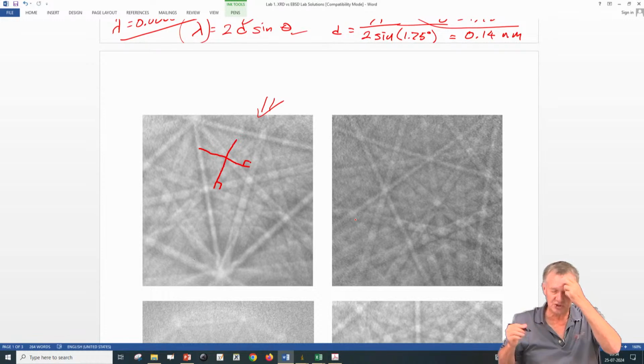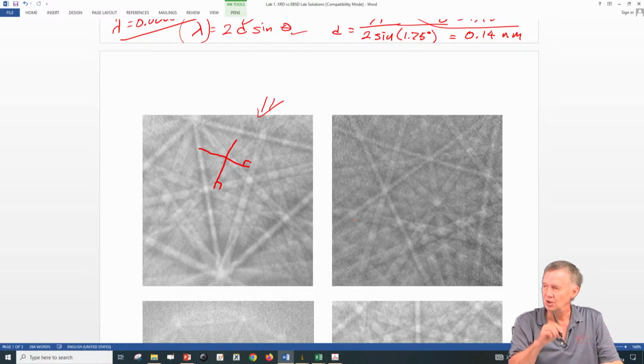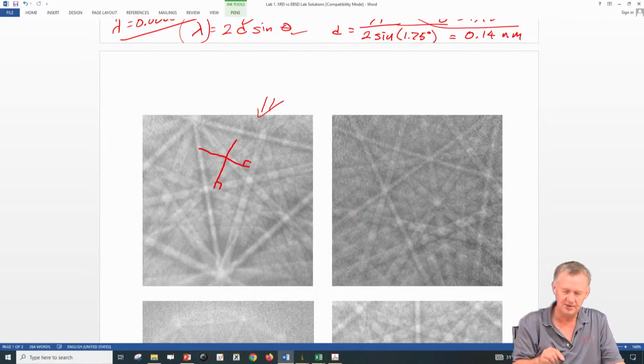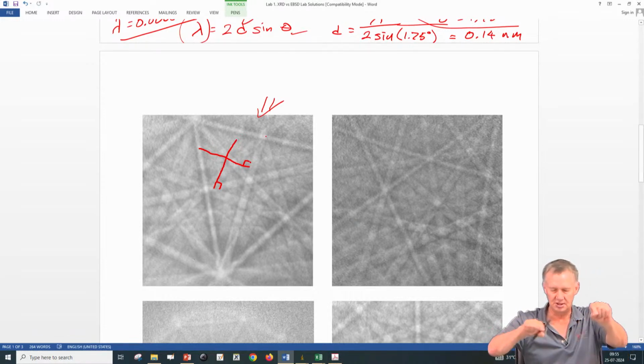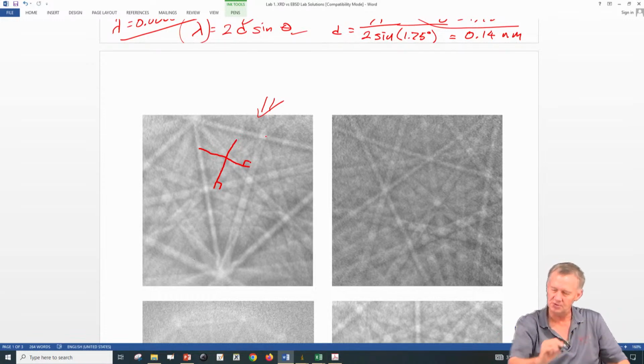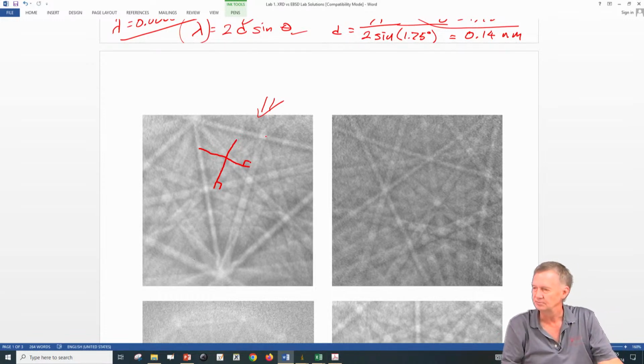Like I said, the software triangulates it from a random pattern. We know how to index it, so it has to be indexed properly first. And then you're looking at where all the bands are, and you know how the gnomonic projection works, so you know what the distortion should be. So you can pinpoint all those and say, okay, that's where the pattern center has to be. So it's just geometry calculations to do that.